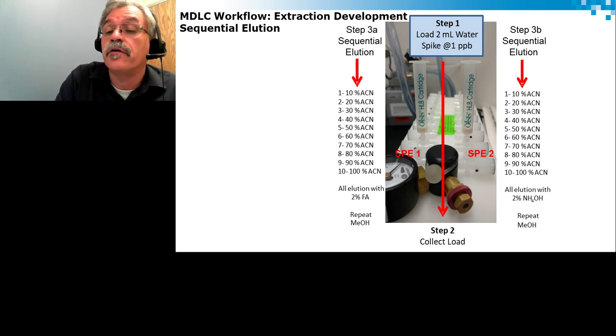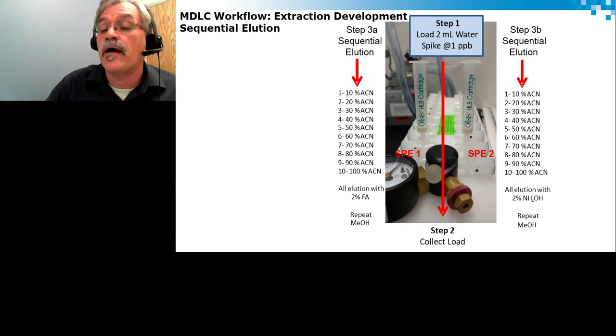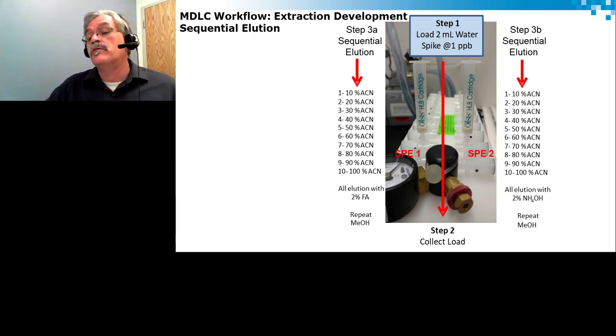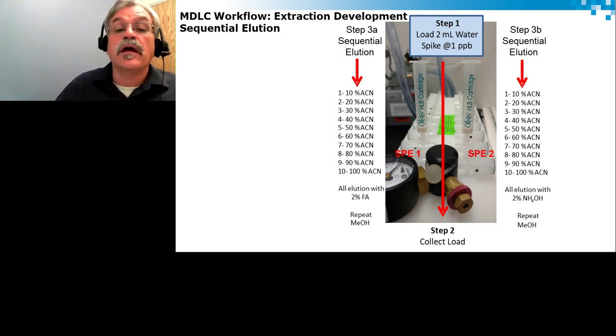Now, this one is a very interesting application because we can have a clear picture of how a compound of interest is eluting off a cartridge. So it's not a matter of guessing, it's a matter of utilizing the same concept as a comprehensive chromatography idea, which is to slice your sample into discrete packets and understand where your compound of interest is eluting. Once we put all these results together, you can see that you have multiple extracts, but in the course of several hours, an evening run or an overnight run, all those results will be delivered the next morning.